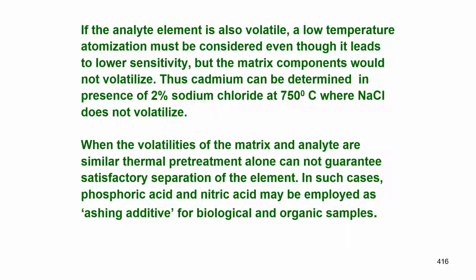In such cases, we can add a little bit of phosphoric acid and nitric acid to the sample, and that helps in ashing biological and organic samples and removing the matrix by forming phosphates and nitrates.